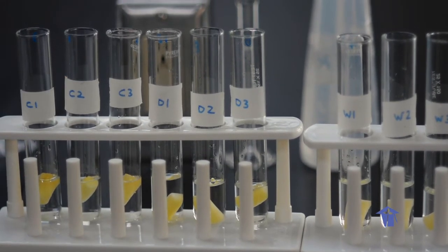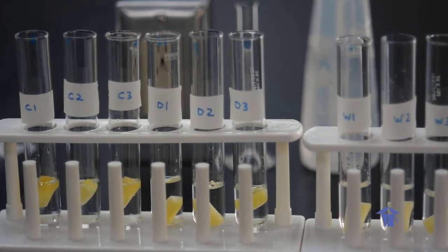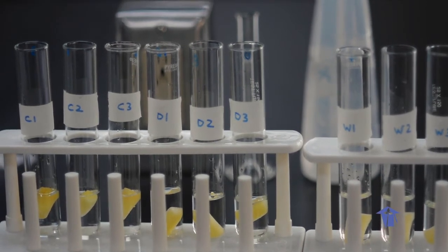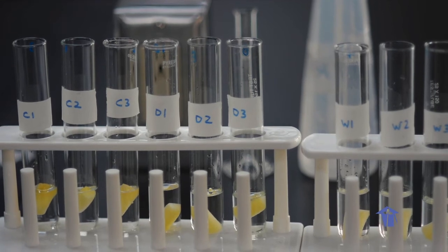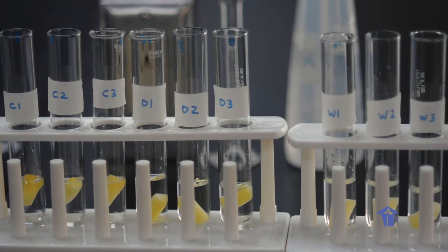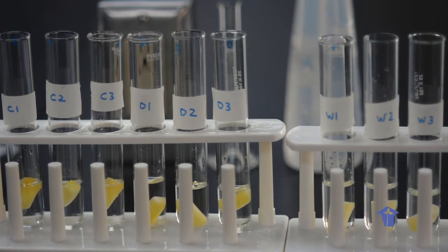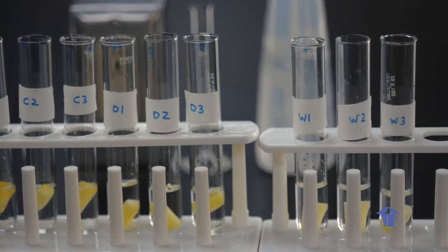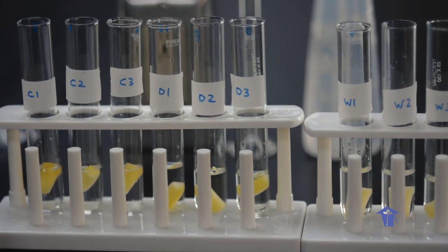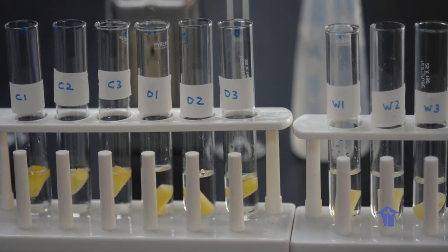The aim of this experiment is to observe osmosis. Osmosis is the process by which water moves from an area of high concentration of water to an area of lower concentration of water through a cell membrane. The potato cells have cell walls, yes, because they are plant cells, but underneath the cell wall there is a cell membrane, and the water molecules would move along their concentration gradient, the concentration gradient of water. So it's moving from where water is in higher concentration to where water is in lower concentration.